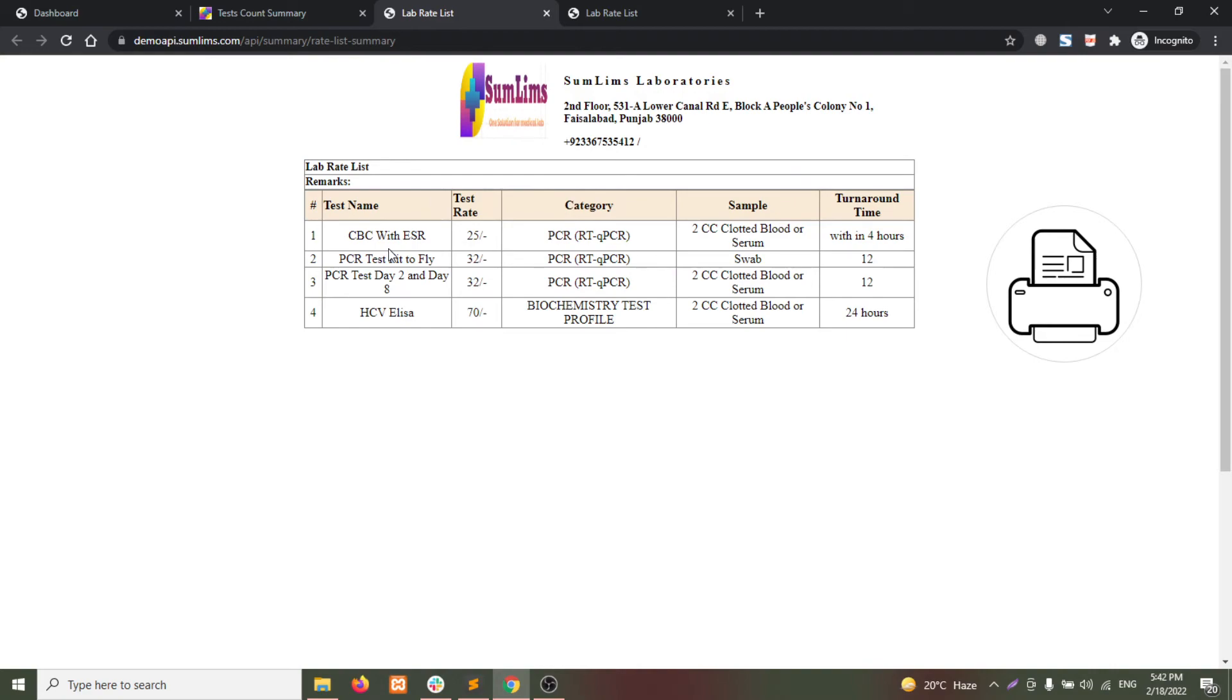So this way you can share the summary of rates and the tests to the other vendors that you are working with.